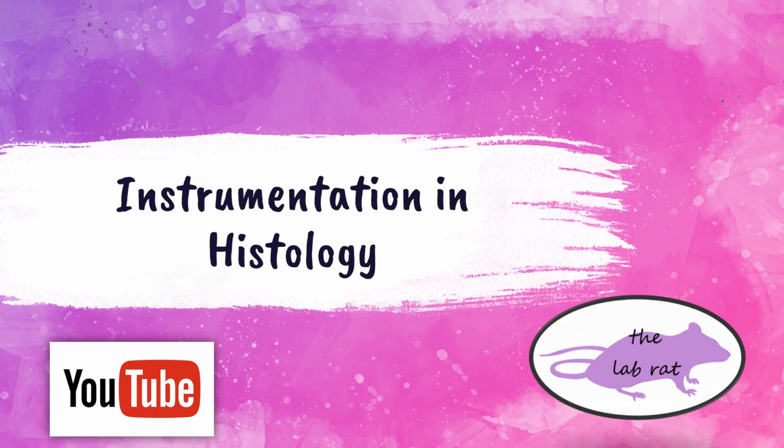In this video, a continuation of our lecture series on histopathology, we're going to be discussing instrumentation that is used in the histology laboratory. All right, let's get started.